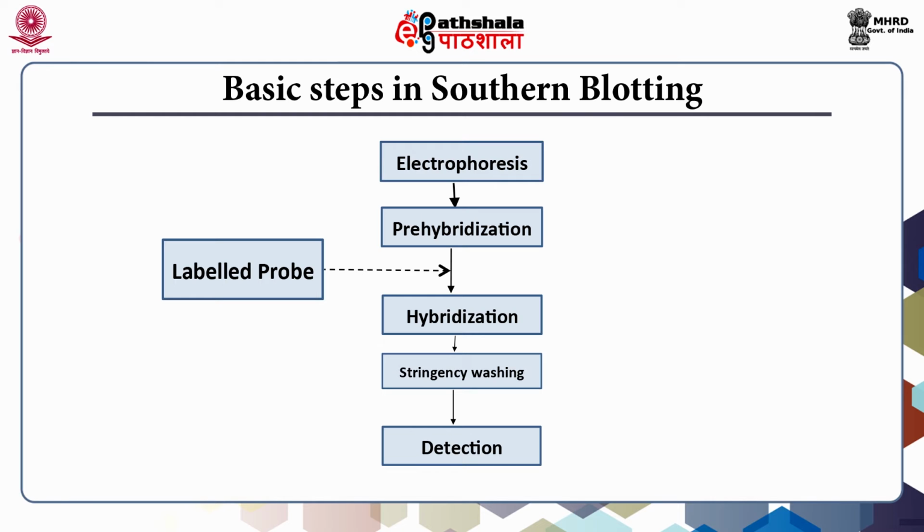It is made clear that Southern blotting is a multi-step technique. Thus, it is essential that each step in Southern blotting is performed carefully. Also, the probe should be specific to allow correct interpretation of results from Southern blotting.